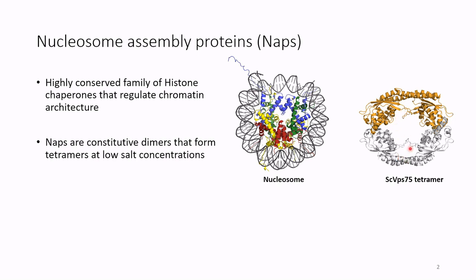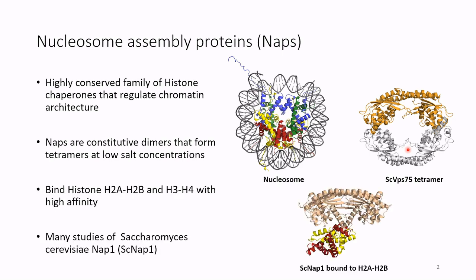This dimer-tetramer equilibrium, however, is dynamic and depends on the concentration of salt in solution as well as the concentration of protein. We are interested in studying how NAP proteins interact with histones.